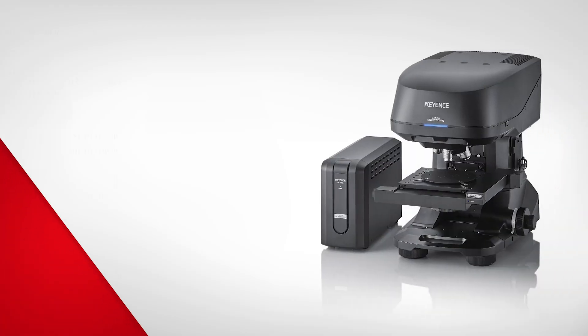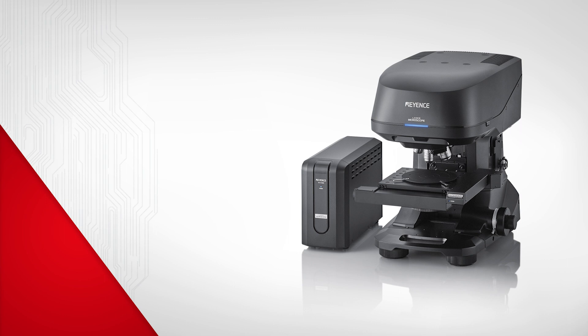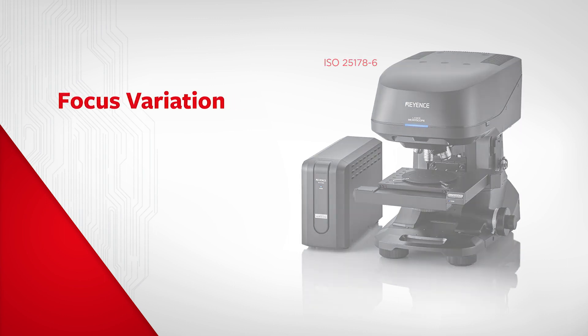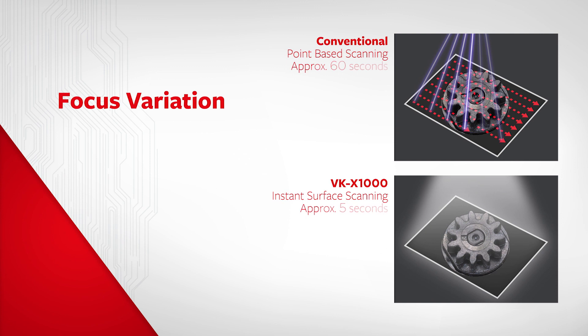The VKX now incorporates focus variation, an ISO certified measurement principle. This new feature gathers surface data 12 times faster than standard laser microscopes.